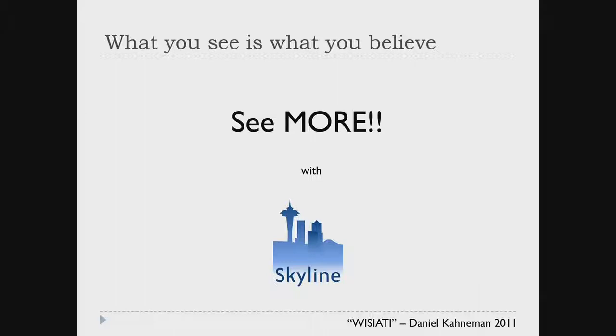So one of the things I decided is our reason for being with Skyline, and one of my great interests, is just allowing people to see the data. Definitely when I started with the program, one of the mass spectrometrists told me, boy, we did a whole study. We got 10 labs together, and everybody collected data, and we had no idea what kind of data we had until we sent it off to statisticians. And then weeks later, they told us which labs had done well and what was good data and what was bad. And I was like, I want you to be able to see that the moment it comes off the instrument. So Skyline has always been about seeing your data.